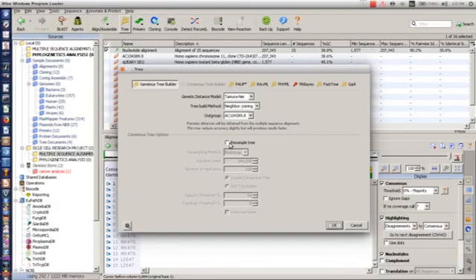So the next thing, you click resample tree. This is very, very important now, so just listen. This bootstrap, you click it. We are using bootstrap. Now the essence of this bootstrap is just to give identical probability numbers, statistic numbers, for us to be able to run the phylogenetics according to what I'm going to be telling you now.